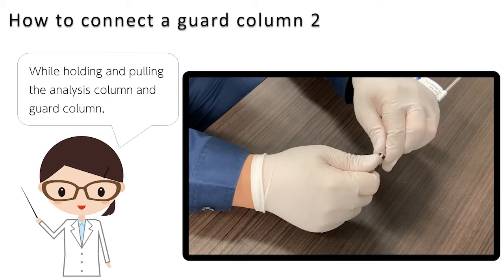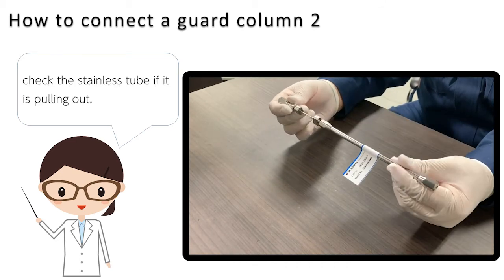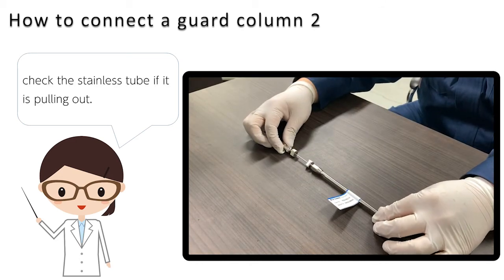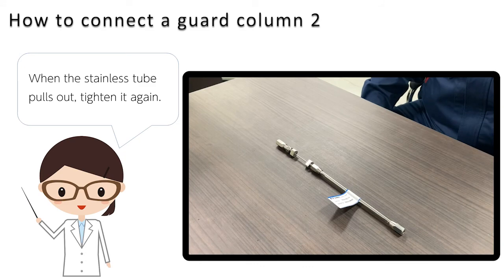While holding and pulling the analysis column and guard column, check if the stainless tube is pulling out. When the stainless tube pulls out, tighten it again.